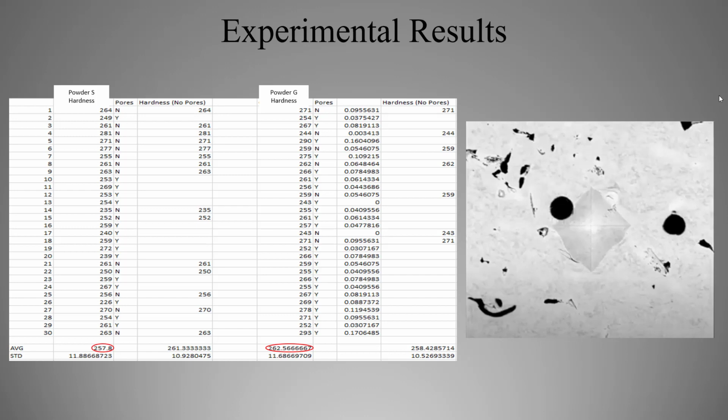Some of the experimental results that were run in the lab to compare with the image analysis are the following. A Vickers hardness test was run on the two samples. A micro indentation was made on the image. The indentation in this case is made out of a diamond. Mostly the shape is symmetrical depending on the material. Sometimes it can skew, causing one of the lengths to be longer than the other. The lengths are measured from point to point both ways.